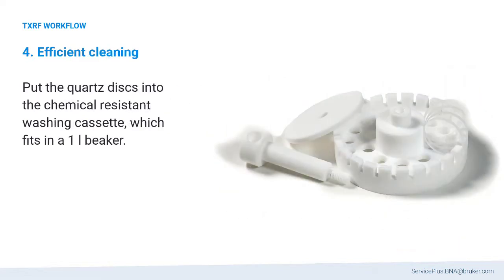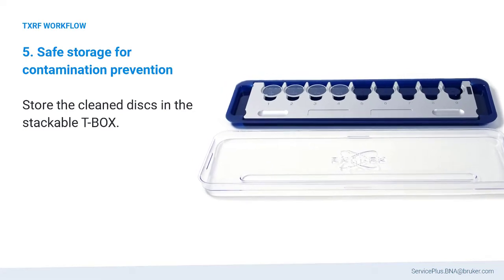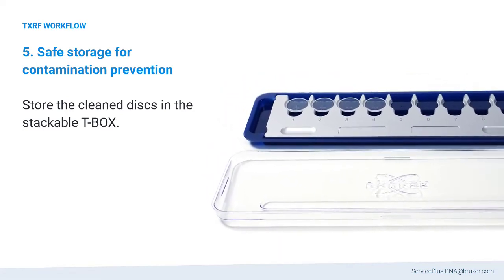After the measurements are finished, sample discs are cleaned in the chemical-resistant washing cassette, which fits in a 1-liter beaker. For contamination prevention, clean discs are stored in the stackable T-Box.